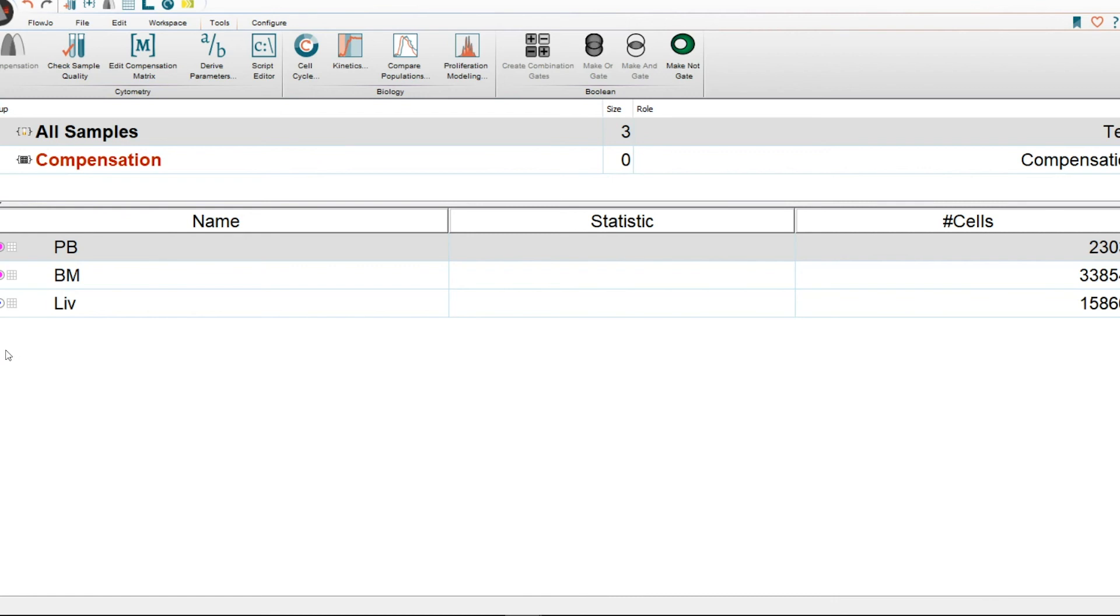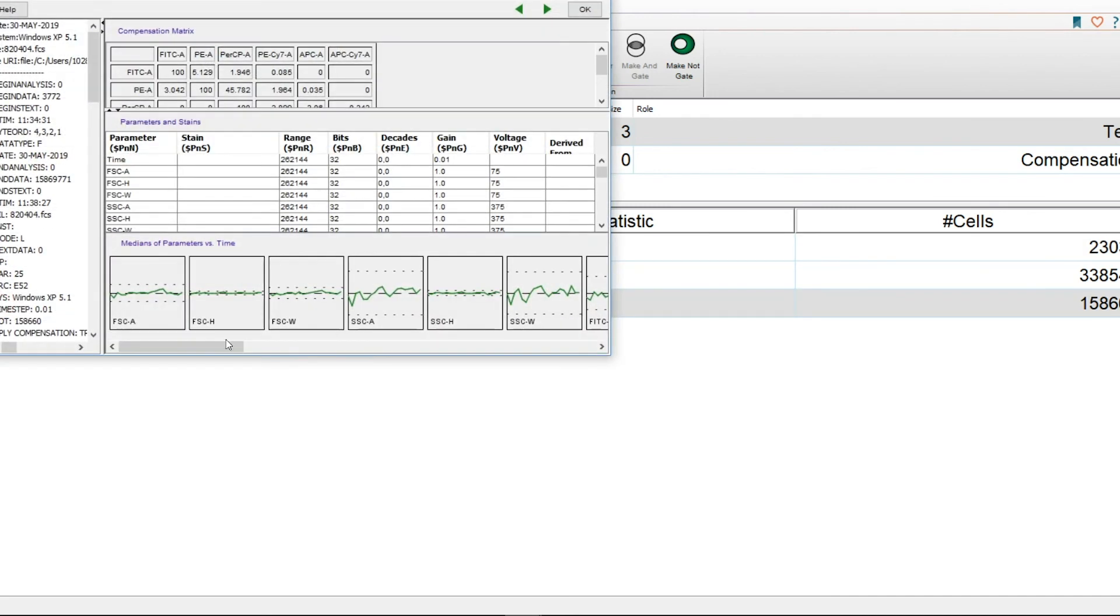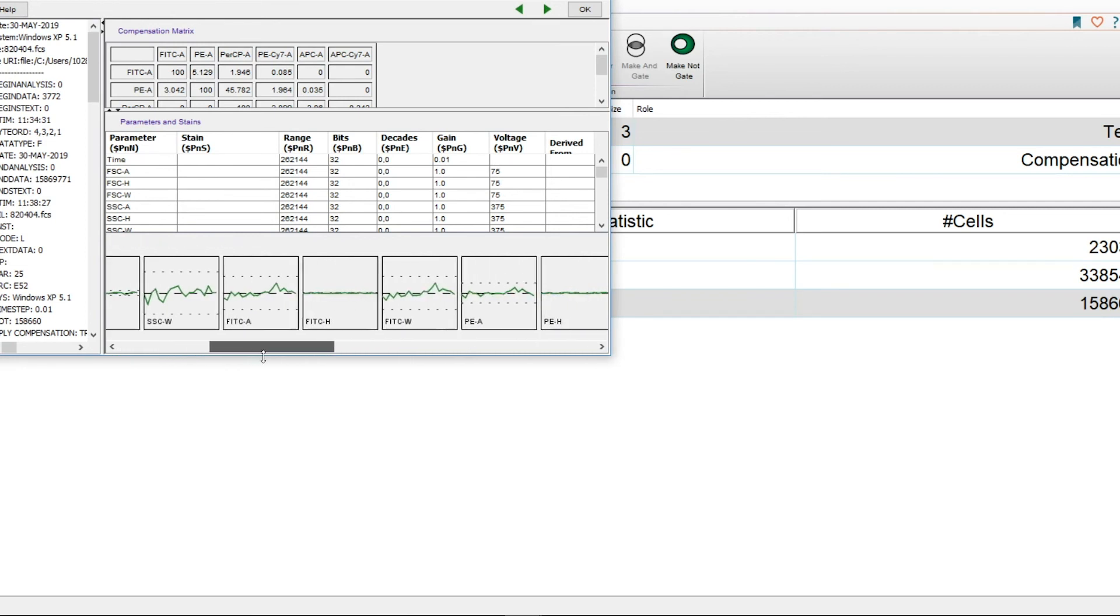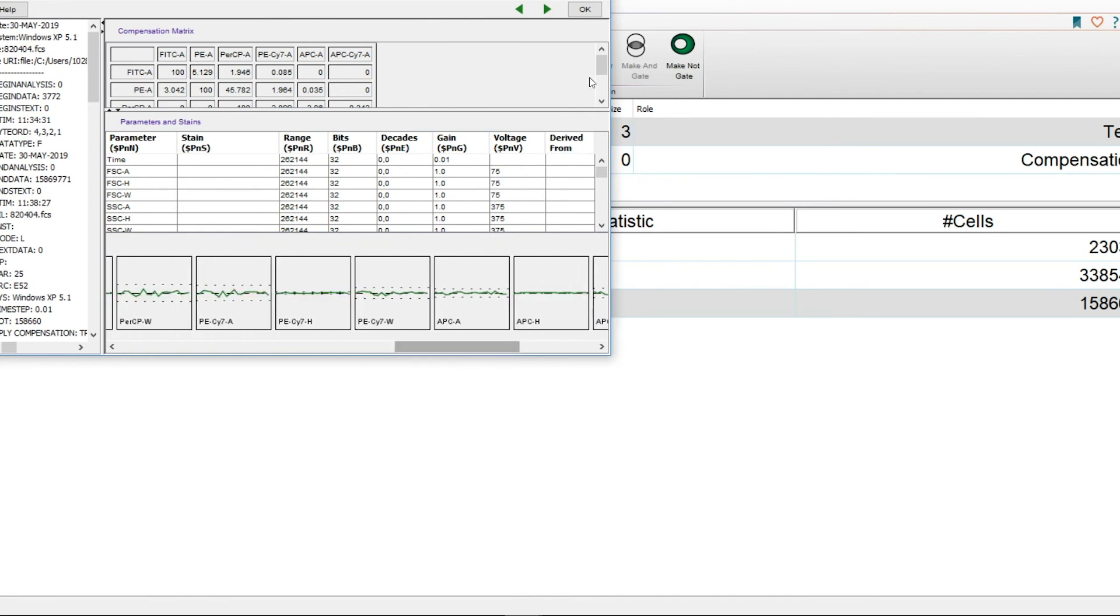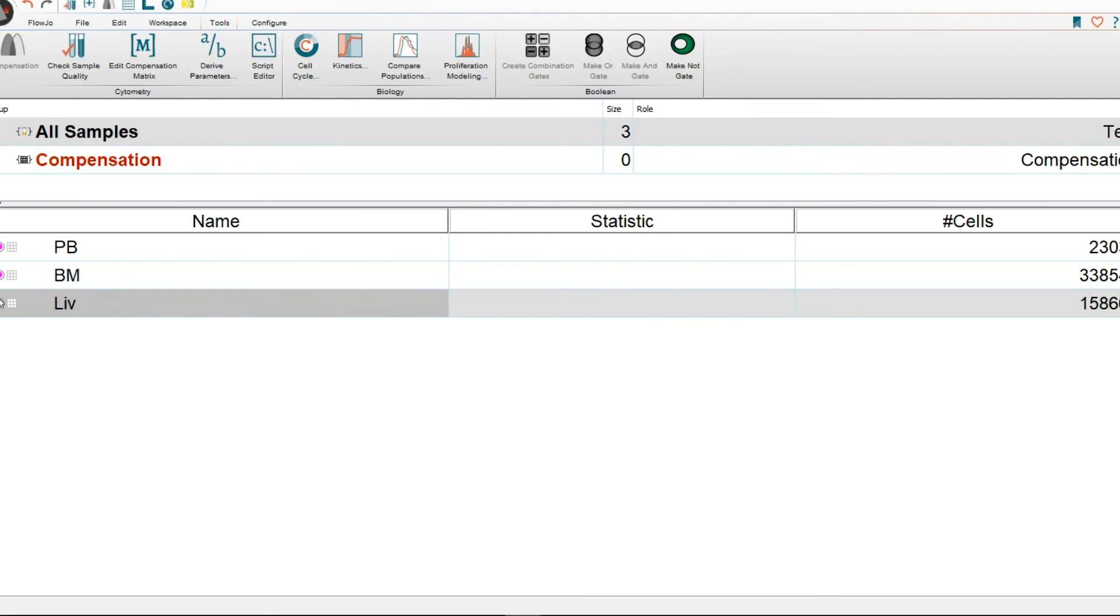So how do we access the figure where we see the median of parameter versus time? You would double click the badge and you would then see the medians of the parameters over time. For this instance, for example, forward scatter is okay, but if we scroll down the options, we see that in fact, all of them look fairly good, which is why this one was labeled with blue.